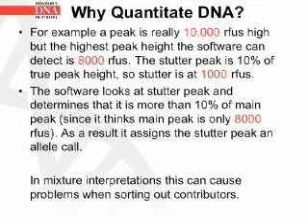When dealing with off-scale data — for example, a peak that is really 10,000 RFUs high, but the highest peak height the software can detect is 8,000 RFUs — the stutter peak, which is 10% of the true peak height, will be at 1,000 RFUs. The software looks at the stutter peak and determines that it is more than 10% of the main peak, because the software thinks the main peak is only 8,000 RFUs. As a result, it will assign the stutter peak an allele call, and in mixture interpretations, this can cause problems when trying to sort out contributors.